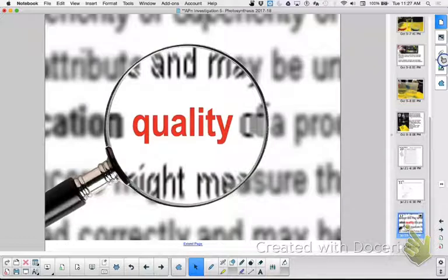You said it was 20 minutes, but then on our data table. I know, 20 minutes is probably safer. You might get them all floating by 15, but you might want to go ahead. Okay, what else?